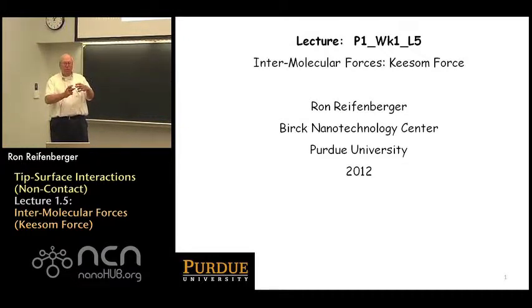The approach we've chosen to follow is we're first considering relevant forces between ions and molecules. Since tips and substrates are comprised of atoms and molecules, we're going to have to integrate these interactions we've been discussing over the shape of a tip and over the shape of a substrate in order to get tip-substrate interactions. That will come in week 2 of the class. But for now, we're still systematically trying to understand the forces between relevant atoms and molecules.